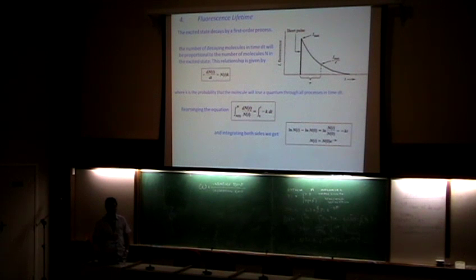This can be done in the time domain, or, like NMR that is done in the time domain and converted to frequency, you can also do fluorescence lifetime measurements in the frequency domain, and just by Fourier transform recover the values of the lifetime.